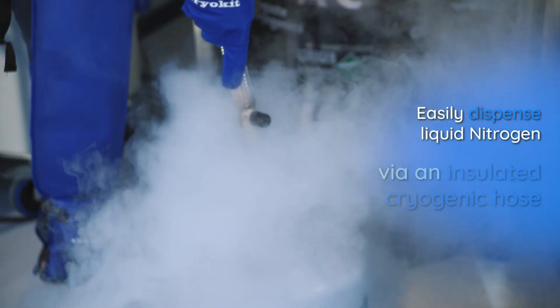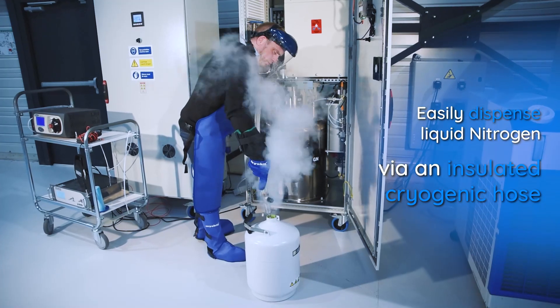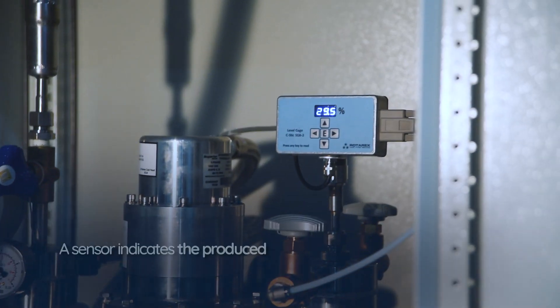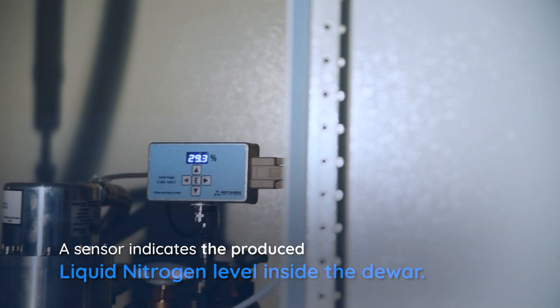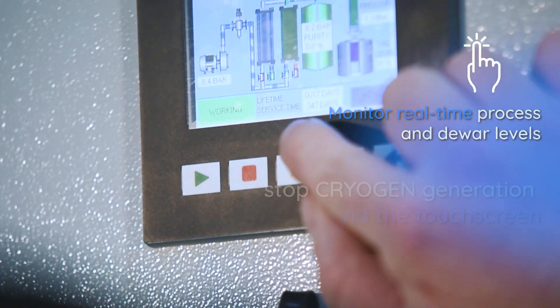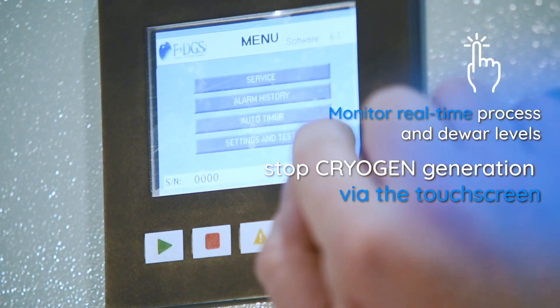Easily dispense liquid nitrogen via an insulated cryogenic hose. A sensor indicates the produced liquid nitrogen level inside the dewar. Monitor real-time process and dewar levels.